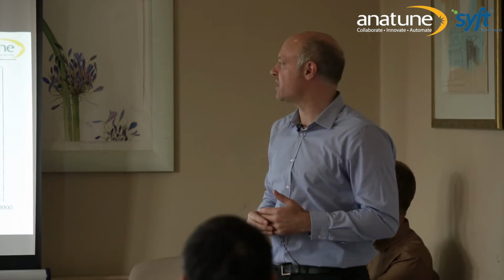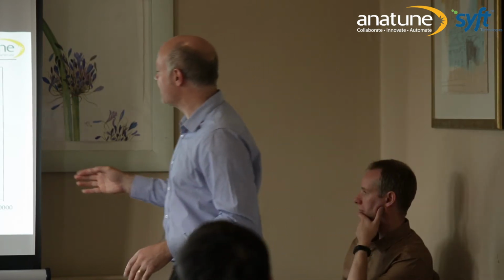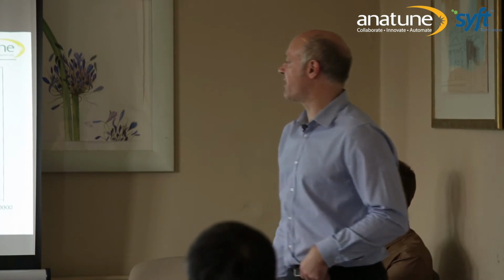And again, this is to do with the top end points pushing that bottom end away from zero. So we needed this sort of top range concentration. What this is telling me is that my lower end concentration in solution is around about 15 ppb in solution. But that's fine, that's perfectly acceptable.